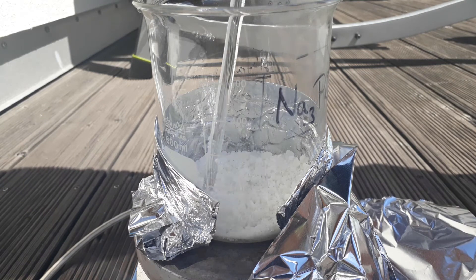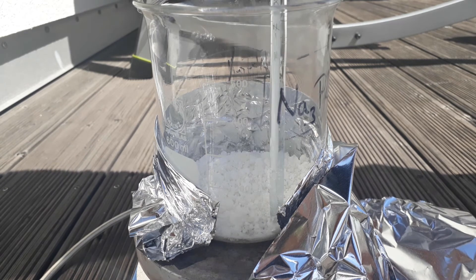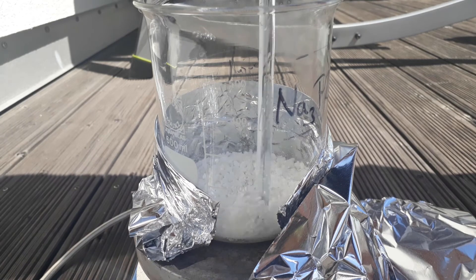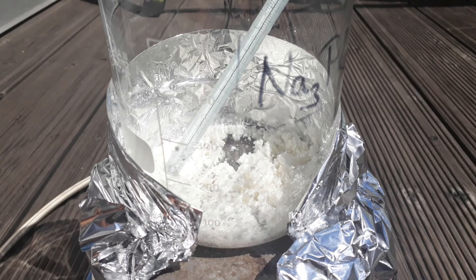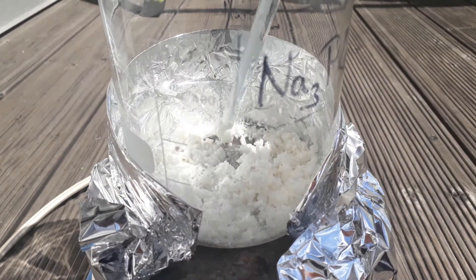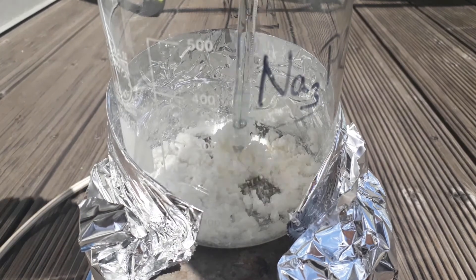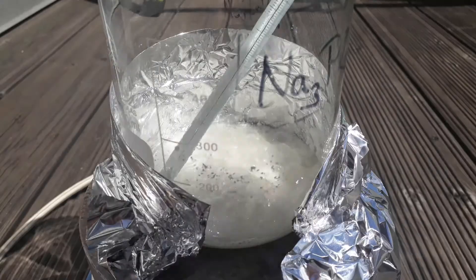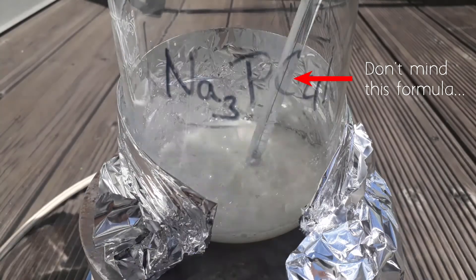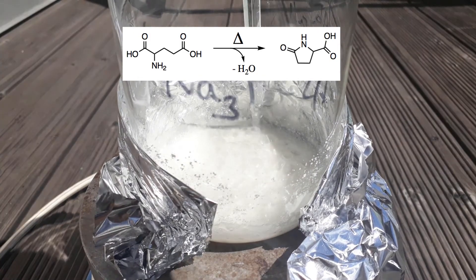If you use dry glutamic acid, this process should take about one to one and a half hours. Only after about one hour into the reaction did the dehydration truly start. You can see some slight bubbling of the reaction mix — this is water being liberated from the glutamic acid molecule, forming pyroglutamic acid. Some 15 minutes later, it started bubbling pretty strongly, indicating of course that the reaction is working.